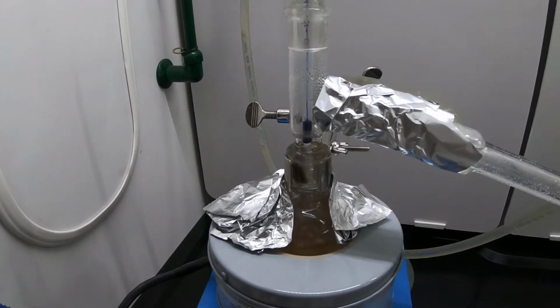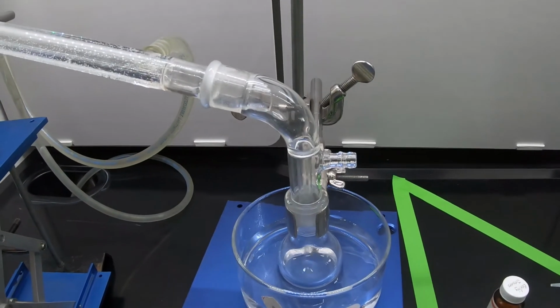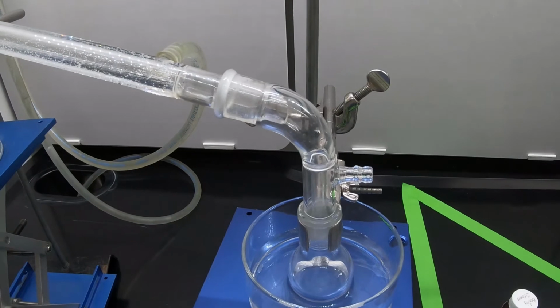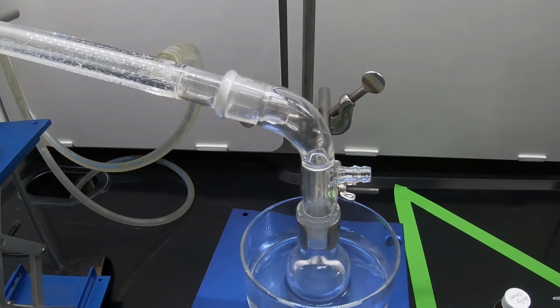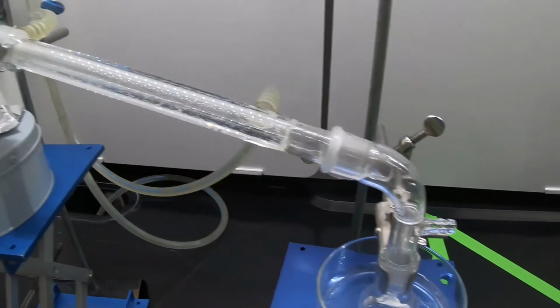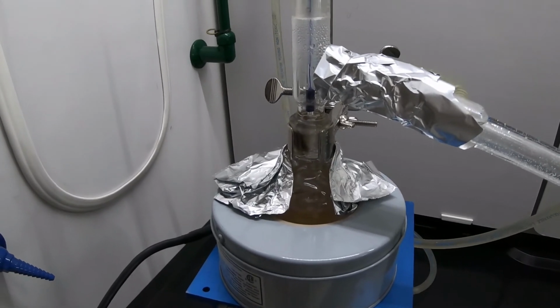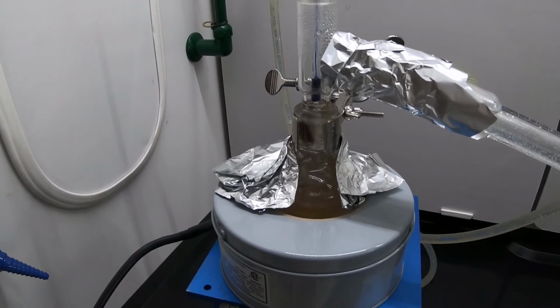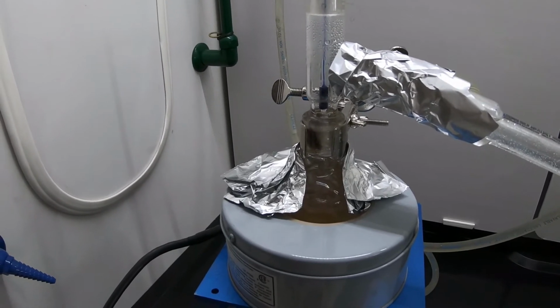It's hard to estimate exactly how much material we've collected at this point, but we're getting drops of material probably about once every couple seconds. Yeah, every 2 or 3 seconds. It's going quite well. So I'm going to keep a close eye on this. When it looks like the material is not completely distilled over, but mostly distilled over, I'm going to stop the heating, drop the heat source, and let the glassware cool.